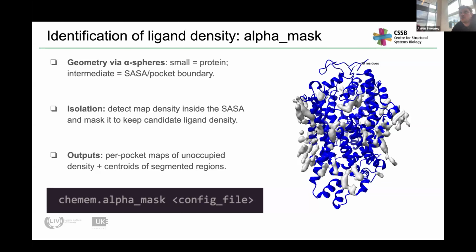The resolution where we went back to the maps and tried to do a conformer search in 2D and tease out both conformations was about 4. I think it was about 4, but it wasn't a good 4 around the binding site, especially. It wasn't really a complete binding site. So yeah, I'm sorry, I don't have a concrete answer. You just have to try, and it's pretty quick to run ChemEM anyway. It could give you an answer.